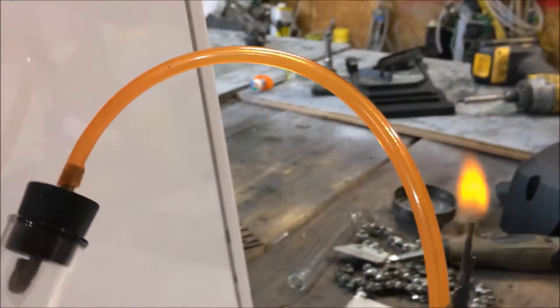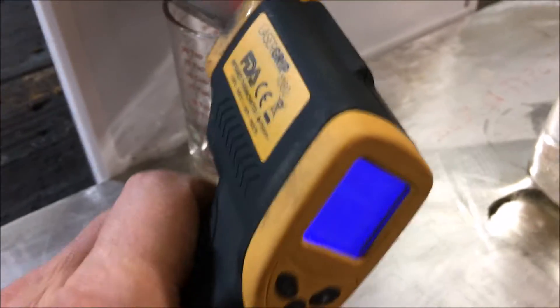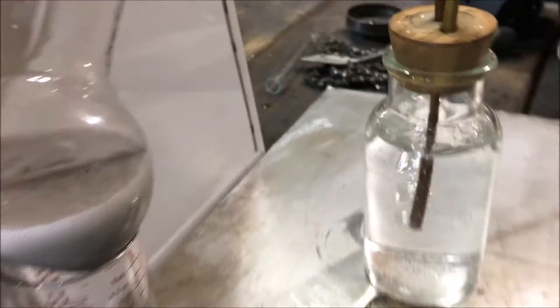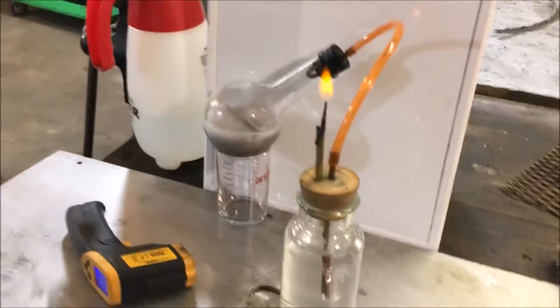I'm going to go ahead and restart the clock now that we have the flare lit. I'm kind of worried about the reaction — it's getting really hot. I'm at 138 degrees here and climbing. I might have to get the spray bottle going on this and kind of cool it off as we go.